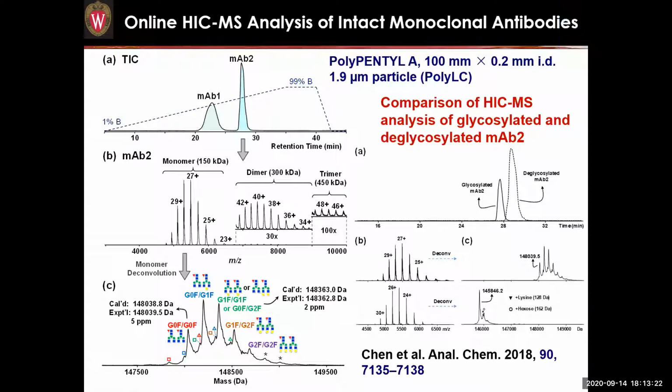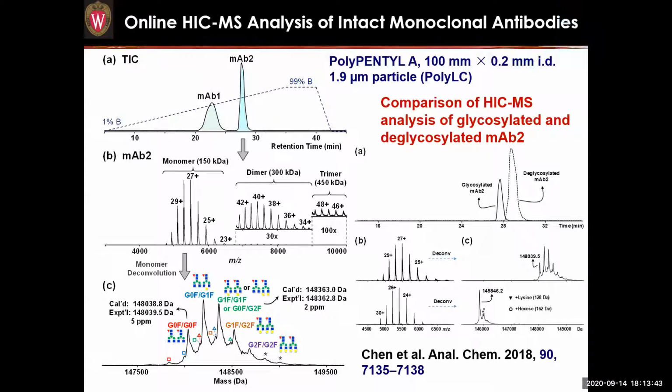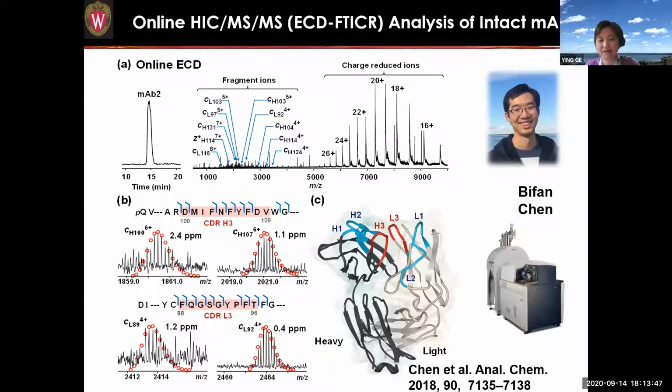So what concentration are we talking about here? I think this is an online approach. I have to check, as I said, I don't work in the lab right now. But it's actually a very small amount needed, almost under a few hundred nanogram range of proteins. Very nice. So this one is from FT, and if you want really good resolution, FT is great.